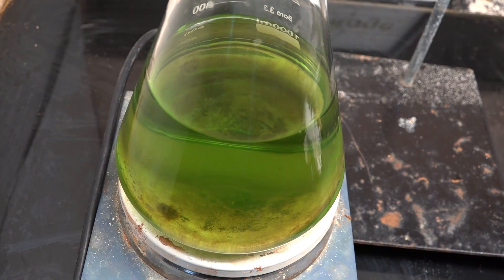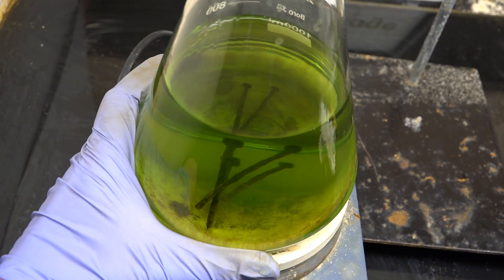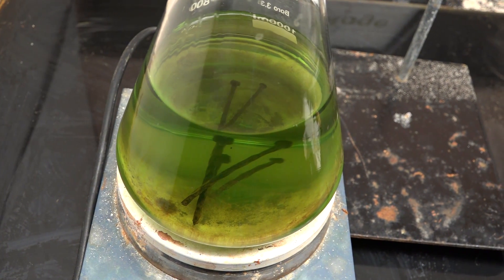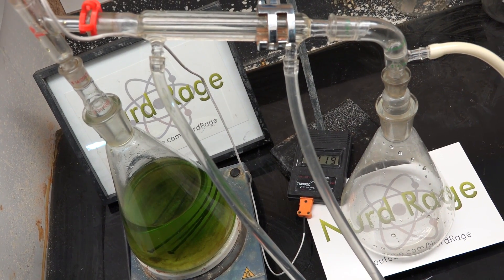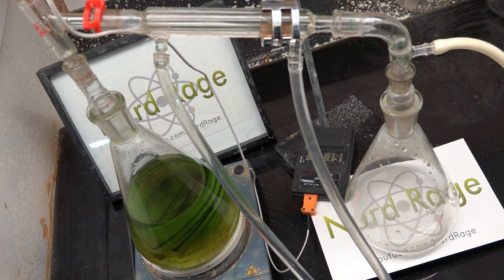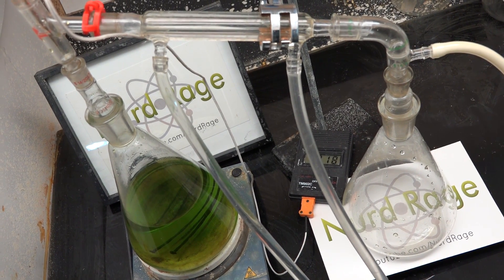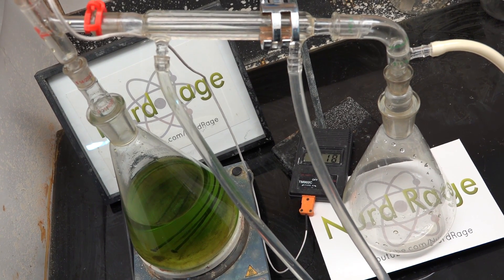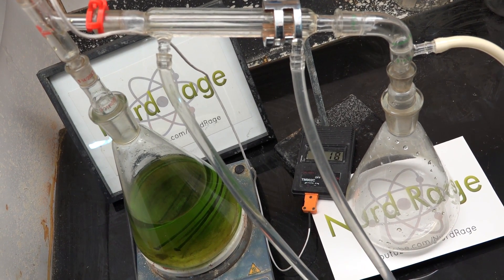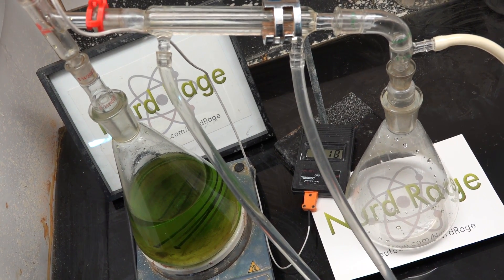Now drop in a couple of large iron nails — doesn't matter if they're rusted, just as long as they're large iron nails. I'll explain their function in a minute. Now set up a simple distillation apparatus around the flask. Use ground glass joints for all the glassware and grease or PTFE tape to seal them so no air can get in. On the distillation adapter at the upper right, attach a long hose so hydrogen gas can escape but slows down the return of air. If you have a one-way check valve, that would also help.